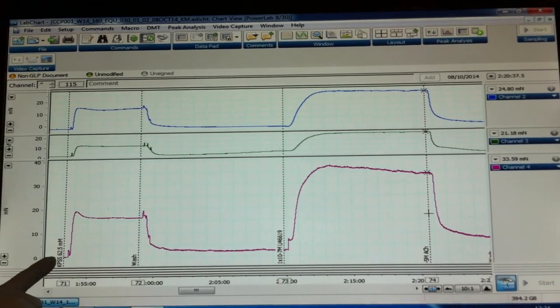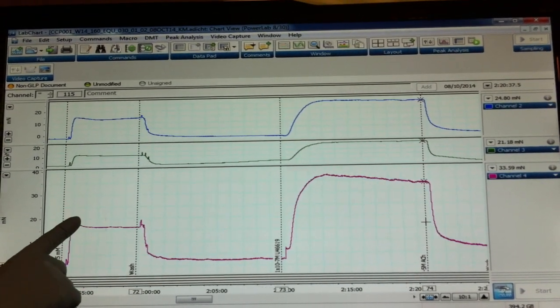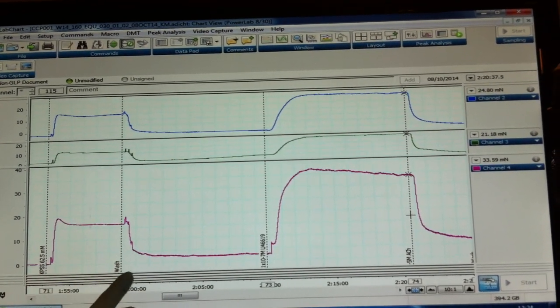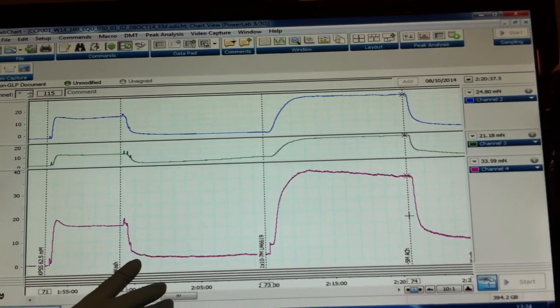High potassium physiological saline solution is added to cause a constriction. Once this response is plateaued, the tissues are rinsed using fresh physiological saline solution.